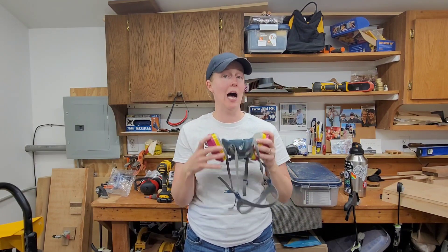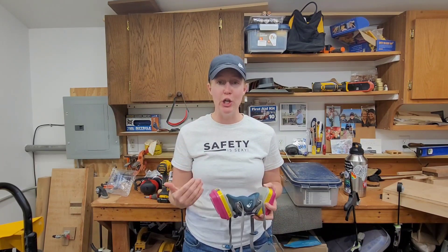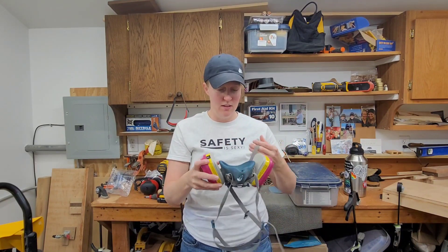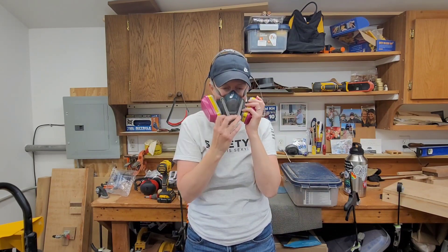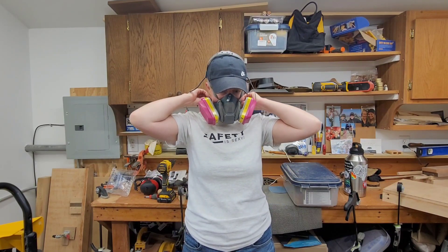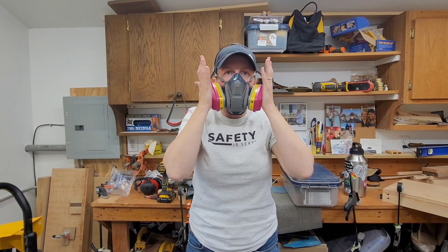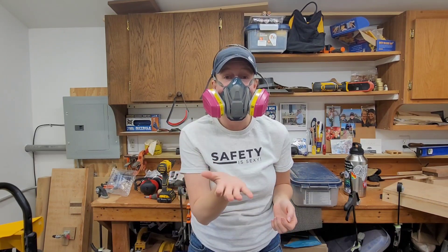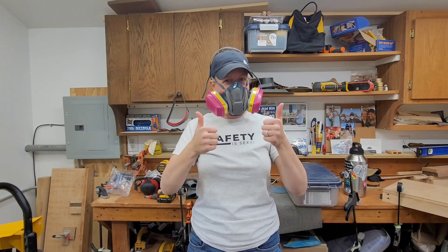Once I put this on and I'm ready to go, it's important that you make sure and check to see if you have a good seal between your face and the respirator. The first thing you want to do is cover the inhalation valves at the cartridges and take a deep breath in. You should feel the mask collapse. Then cover the exhalation valve and breathe out. The mask should bulge, but you should not break the seal.